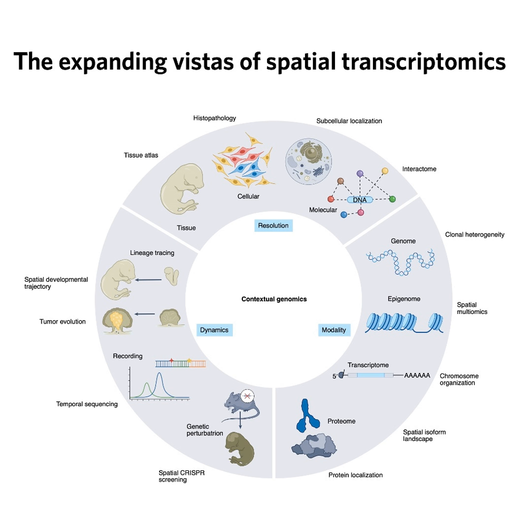Exactly. And second, alongside that, we desperately need the development and adoption of generalizable open source image processing pipelines and standardized data formats. The amount of complex imaging and sequencing data these technologies produce is staggering, and right now, analyzing it is often a bespoke, lab-specific bottleneck. We need common tools. So if we can tackle these standardization and data handling issues, it really clears the path for this future of contextual multi-omic dynamic genomics. It does. We really do now have a clear technological trajectory emerging for generating these true 4D maps of biology, integrating space, molecules, and time.